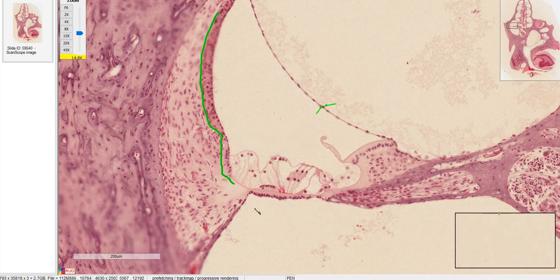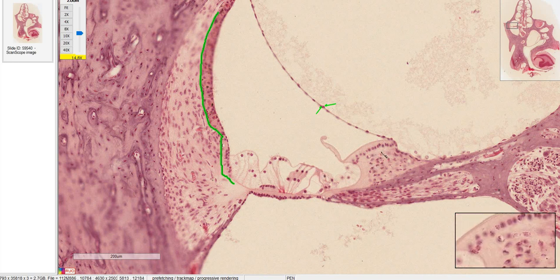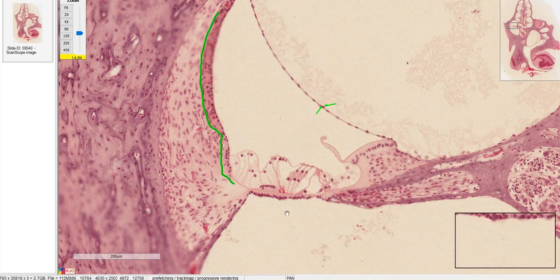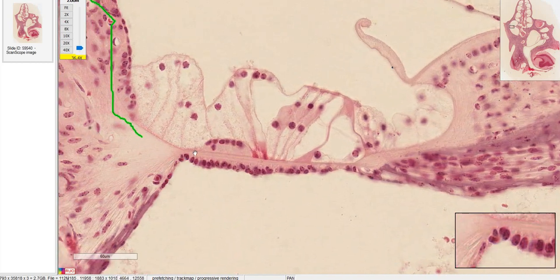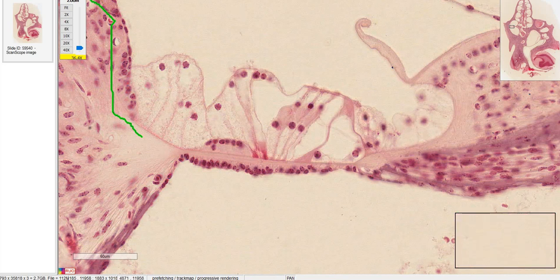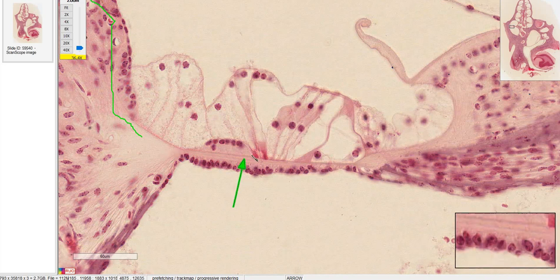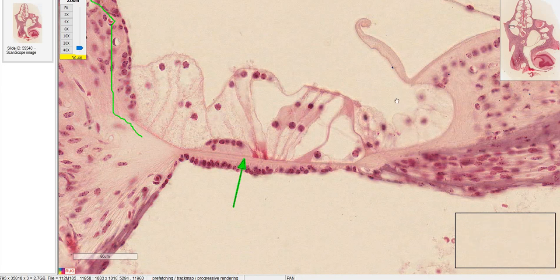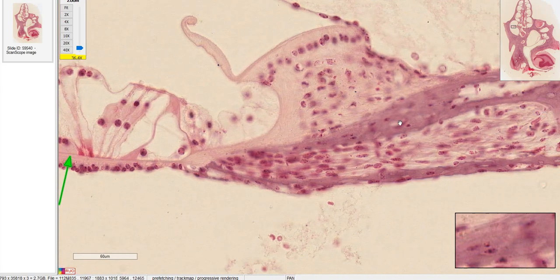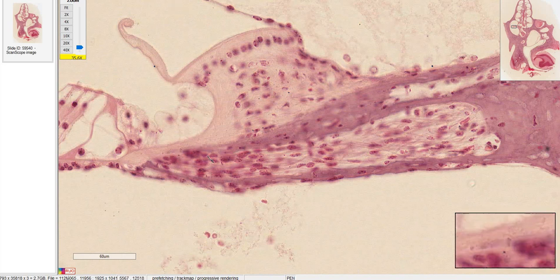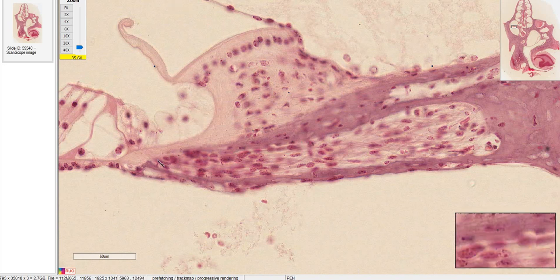All of the structures in the middle make up the organ of Corti. But first, let's talk about the spiral limbus and the osseous spiral lamina. The spiral ligament tapers off quickly into the basilar membrane — remember, this is the thing that bounces up and down when the sound wave comes in. Moving past the organ of Corti, we have this tissue which looks like bone: this is the osseous spiral lamina.